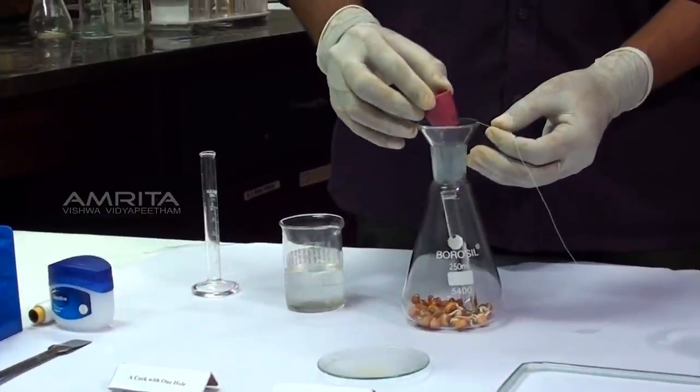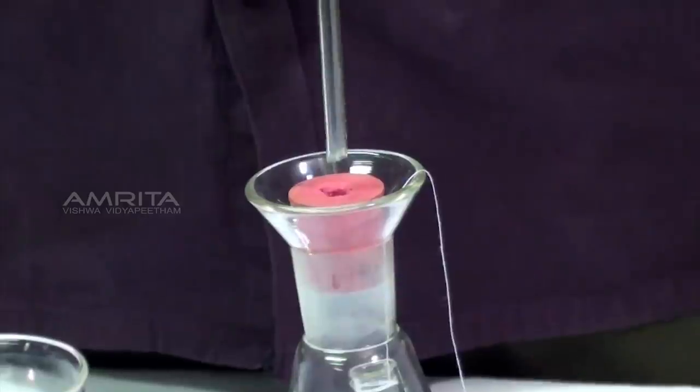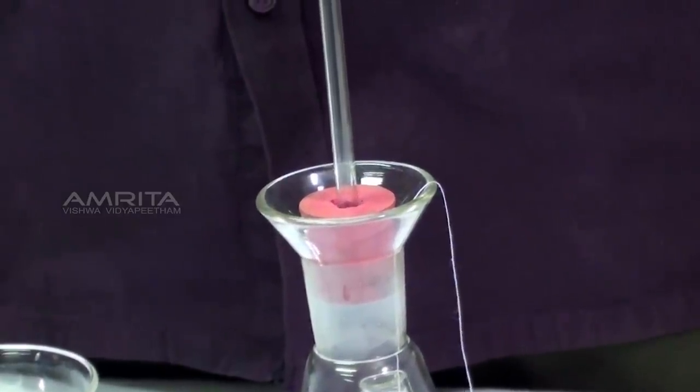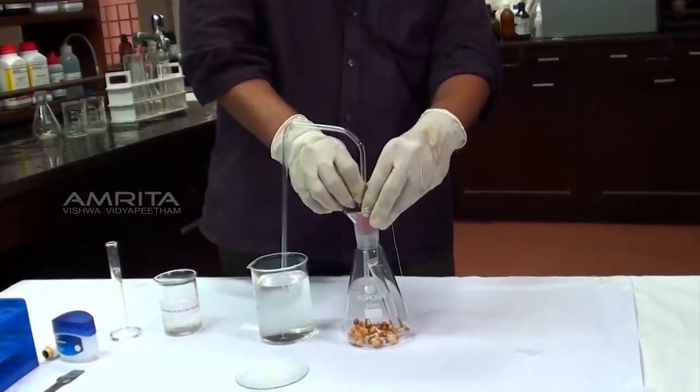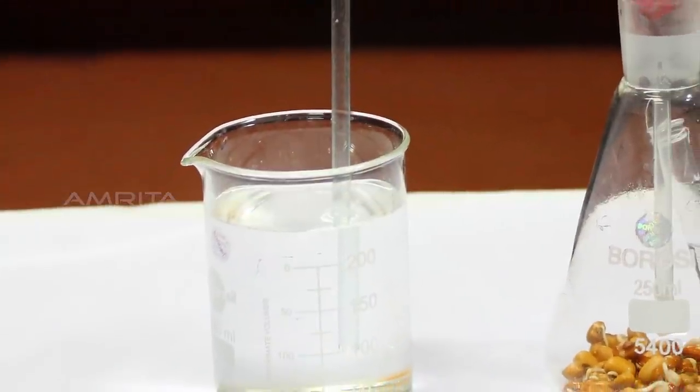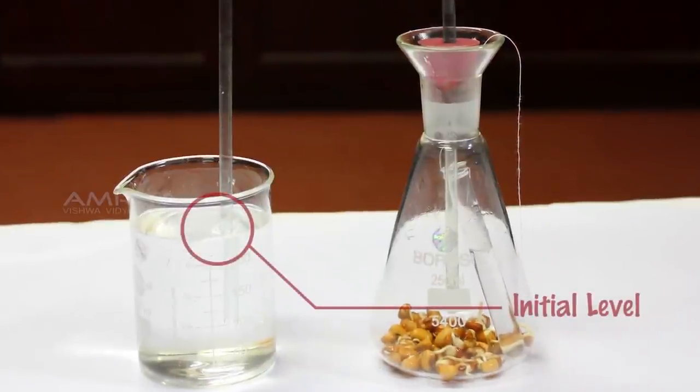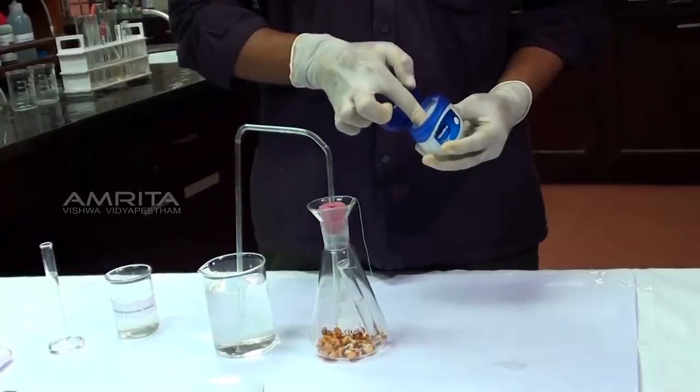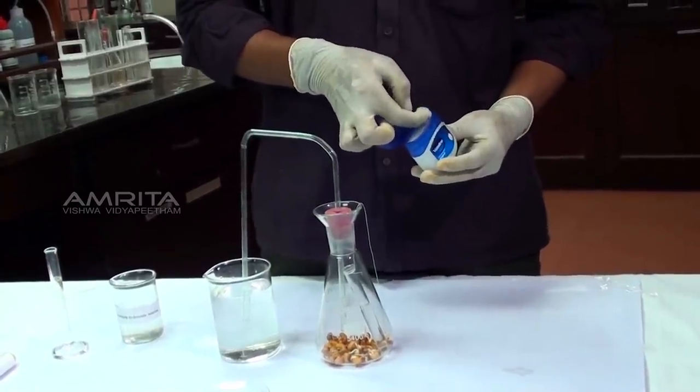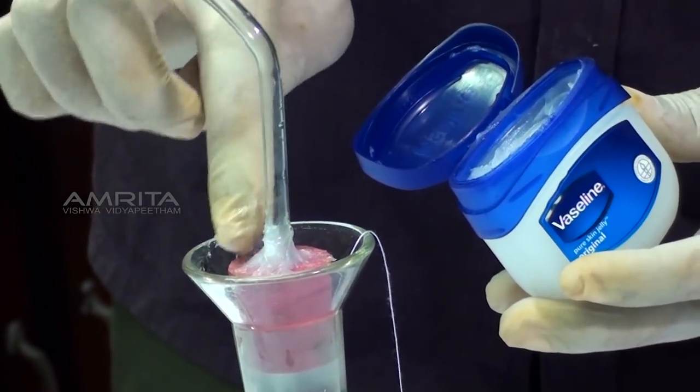Close the mouth of the conical flask with a cork. Insert one end of the delivery tube into the conical flask through the cork and dip the other in a beaker containing water. Observe the position of the water level in the delivery tube. This is the initial reading of the water level in the delivery tube. Use your finger to take some petroleum jelly, then apply the petroleum jelly on the cork to make the apparatus air tight.